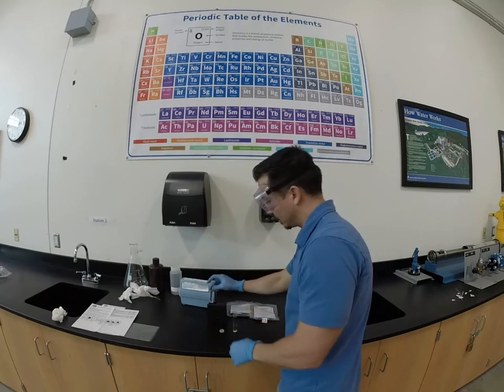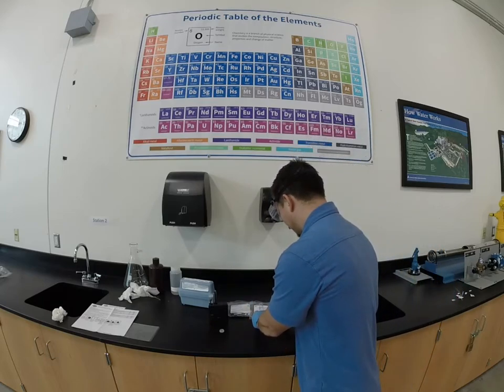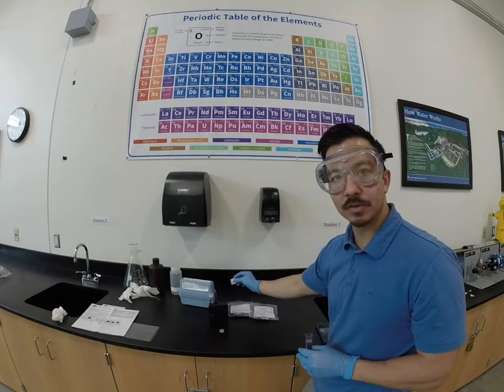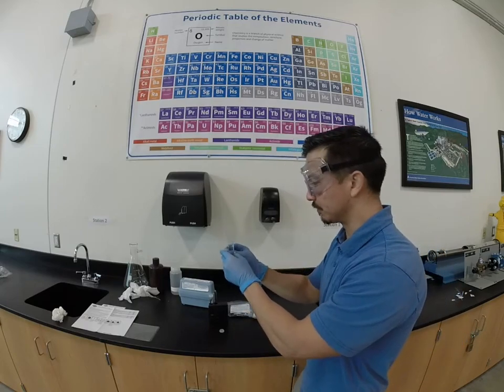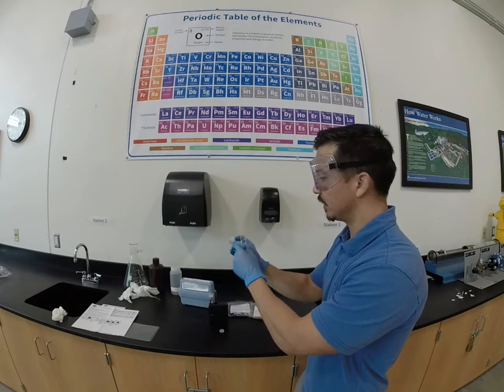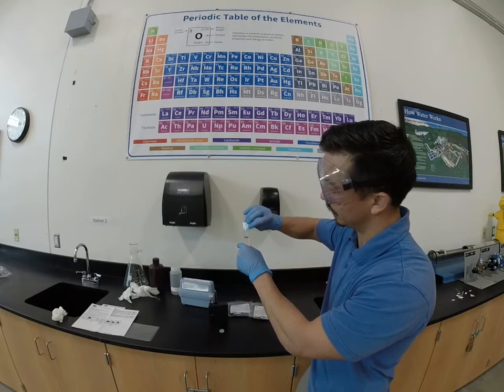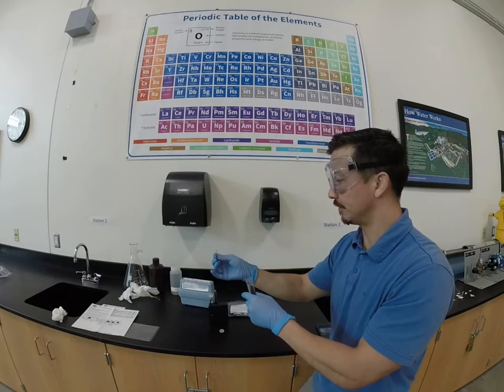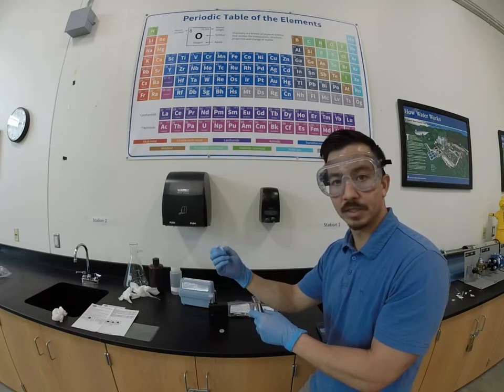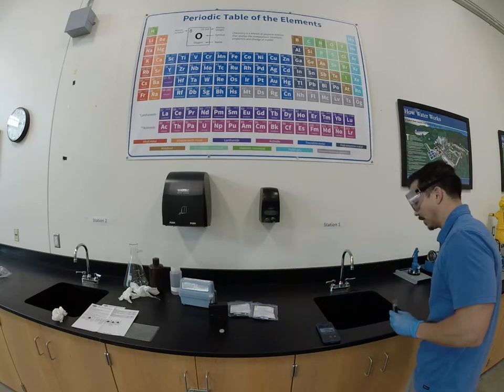We're going to cap the blank and leave it in our comparator. The water sample we're actually testing, we're going to add our DPD reagent. This particular field kit comes with a free chlorine and a total chlorine reagent. We're going to be using free chlorine, which is what we're testing here — it says so on the little packet if you get your packets mixed up. This reagent can be irritating to the skin as well as the eyes, so that's why I'm wearing proper PPE.